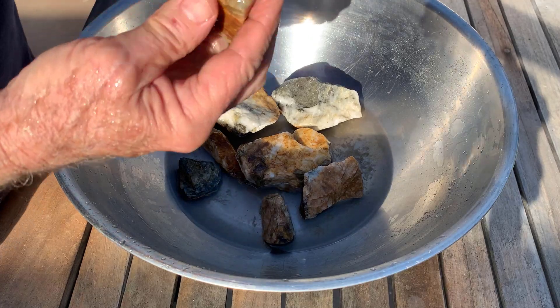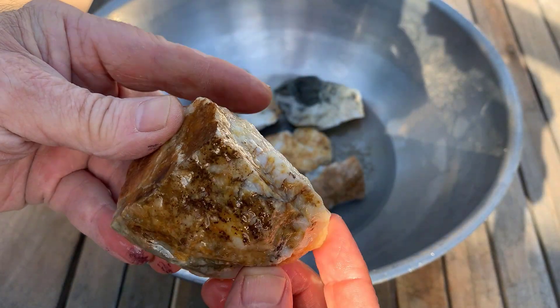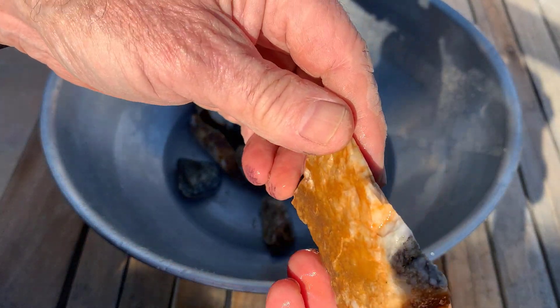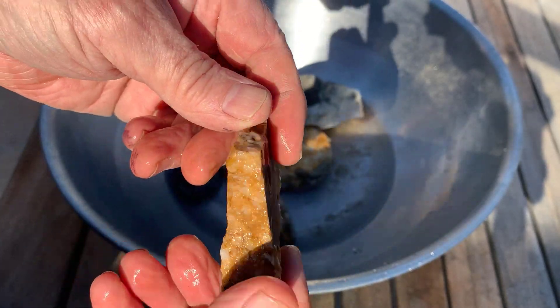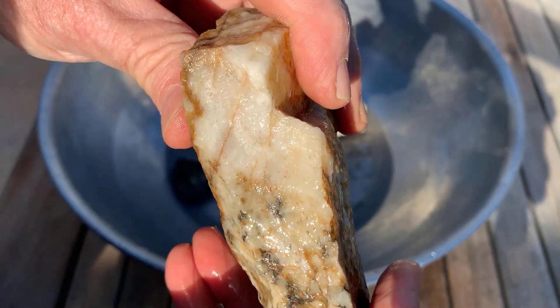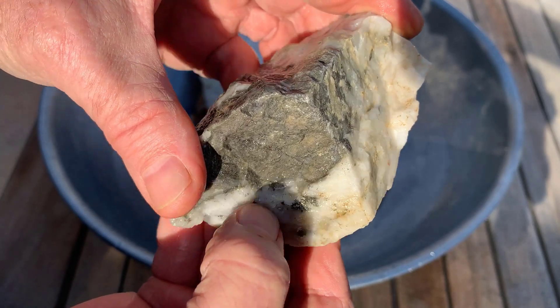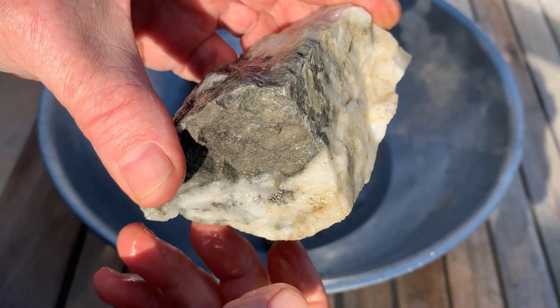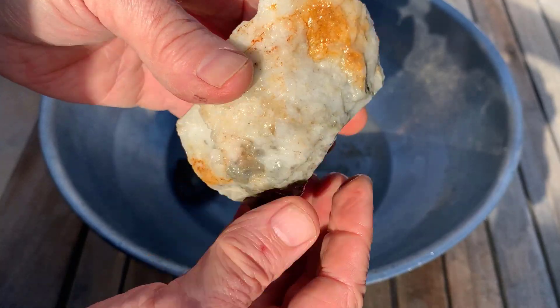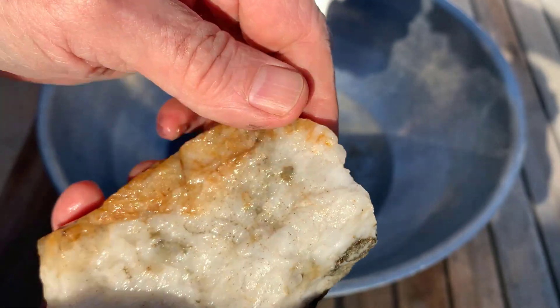I washed off a few and I'll let you take a look at them. There's that sulfide or whatever it is. Jason says maybe it's a telluride — I'm not sure if that's the telluride or just the sulfide. Something gold-looking there, but it doesn't have the luster of gold. I'll get my loupe out and take a look at that.